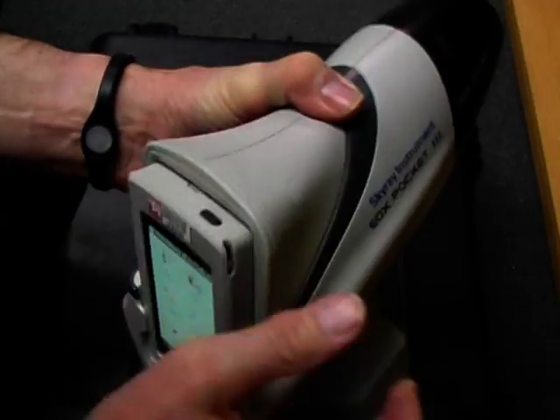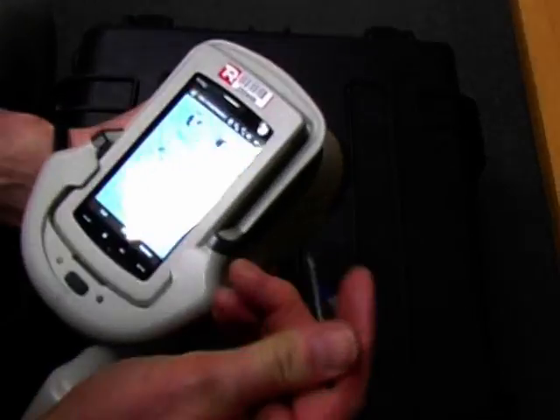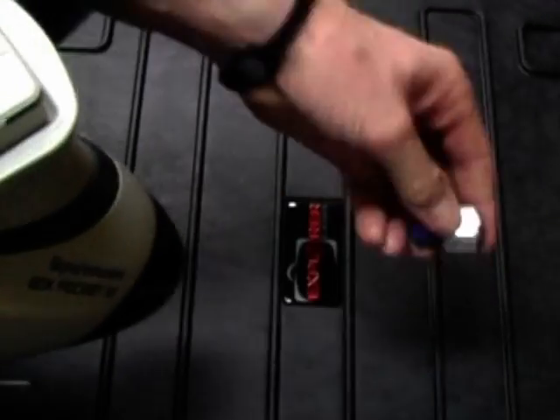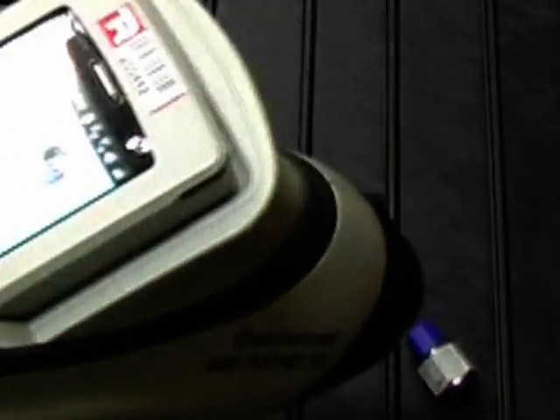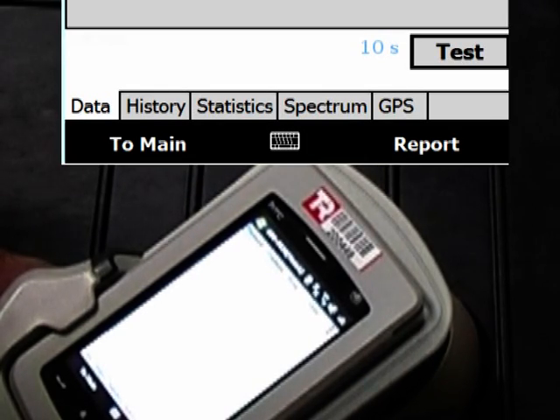I'll open this window — it's ready for testing, set to match. We've set the system. Now I need to test the sample here. I'll put this on the bench and hit the test button, then point it at the sample. You can see it counting down.